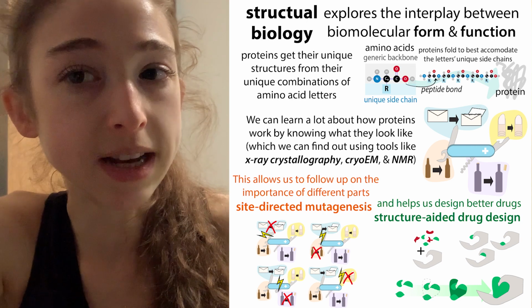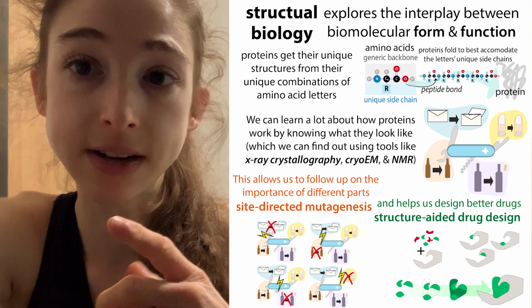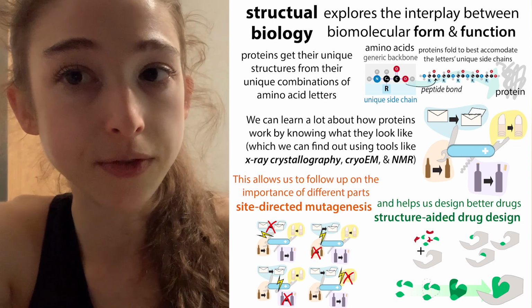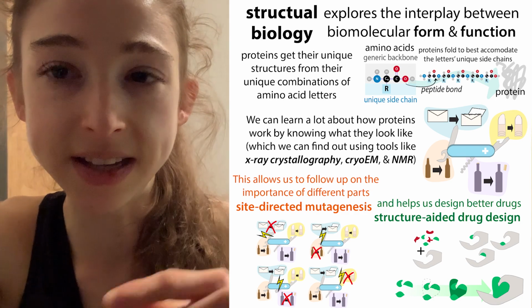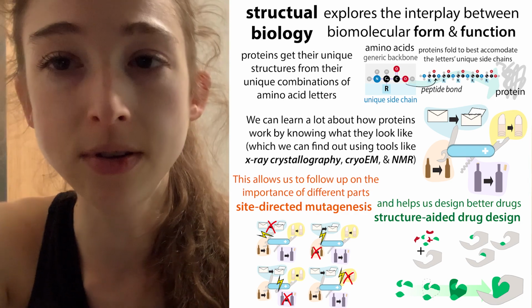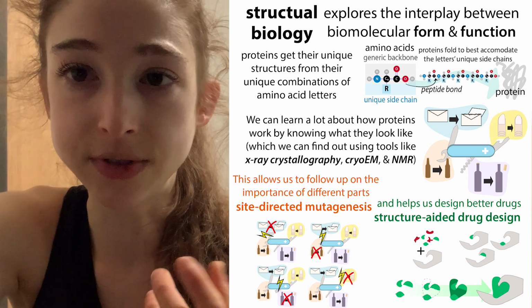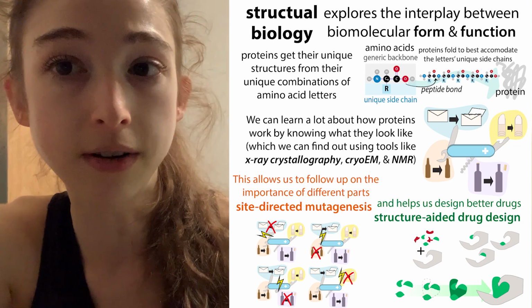So yeah, there's also a technique called NMR, which can be used for some really small things that are really flexible. It's not so good for bigger things, but it works by the molecules tumbling, so they have to be small enough to tumble, and then you need a lot of the sample. But yeah, it is used for some things. But the 2 main ones are really X-ray crystallography and cryo-EM.